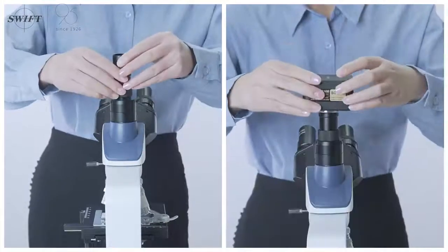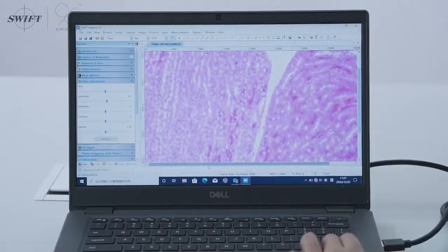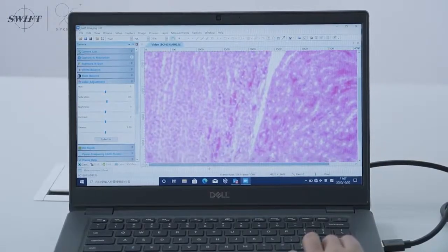We now connect the camera to the computer through the data cable on the third observation head of the product, so that the image under the mirror can be presented in our computer software.